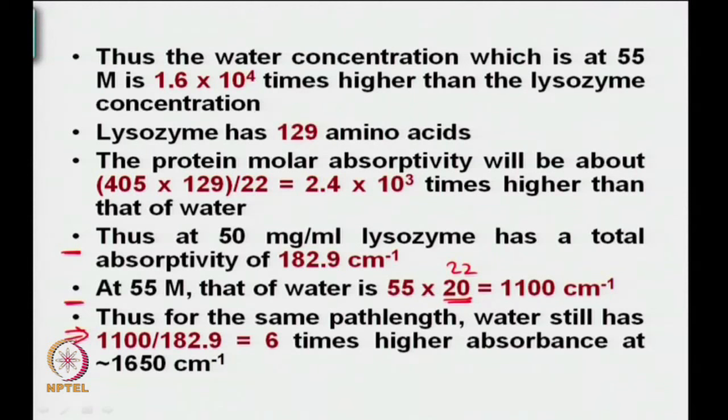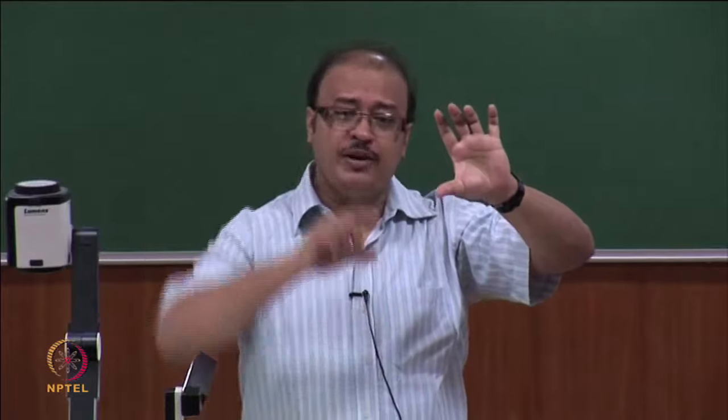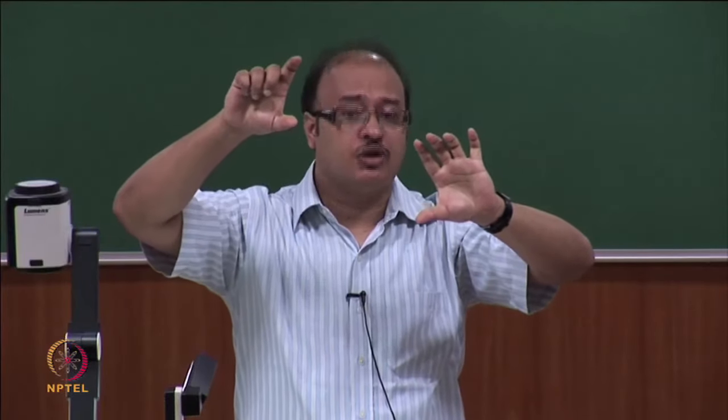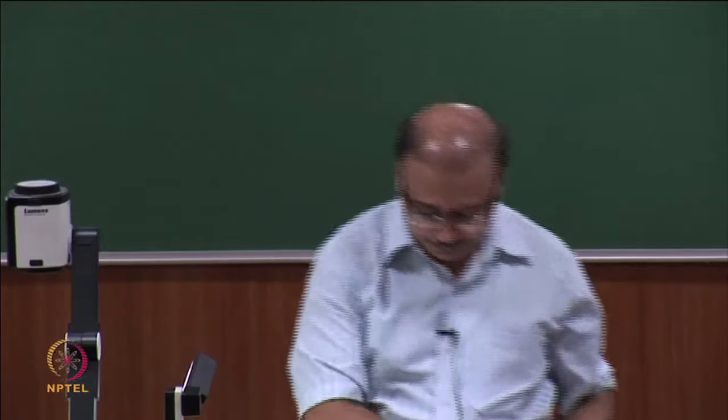Now, no matter what you did, you increase the concentration to about 3 or 4 or 5 millimolar, that is a very high concentration. But you look at the concentration of water, 55 molar, and you can see how much contribution from the OH bend you would have in this amide 1 mode. The amide 1 mode you see would be the actual contribution from the amide 1 mode of the protein plus that of water, and that increases the total intensity.